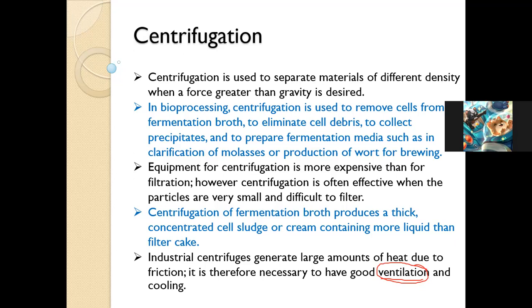If it is a clean room, the airflow in should be sterile before it flows. A good design of ventilation can help control the heat in the system.